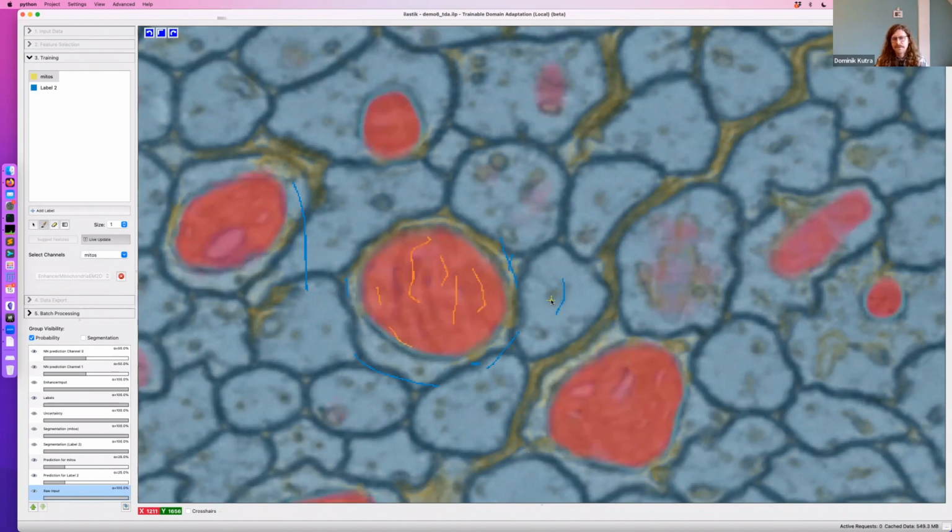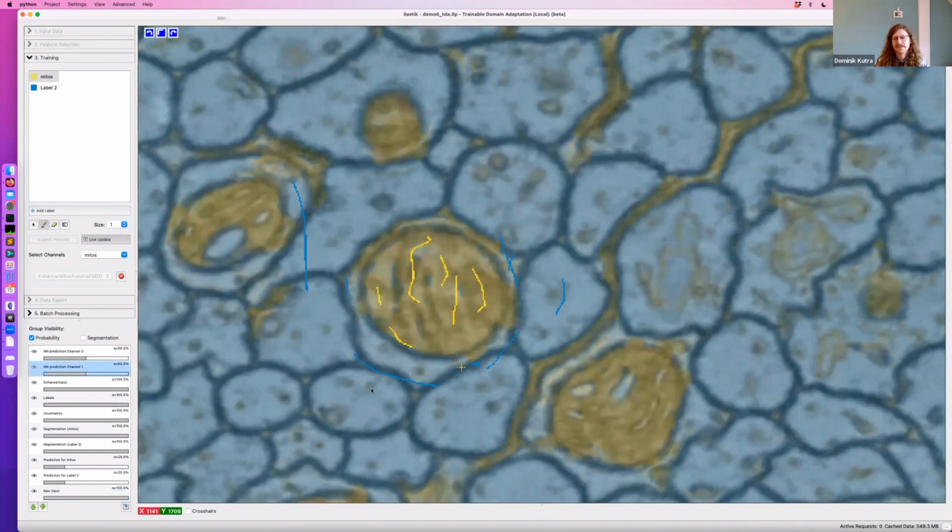What you see now are the neural network predictions that come out by looking basically only at this yellow data that you can see here. It takes the yellow, puts it into the neural network, and corrects it. Of course, this is still not perfect, but the idea is that you go on training your random forest and make it better, and this regenerates new predictions and does the neural network prediction on top of it again, like this, over time.